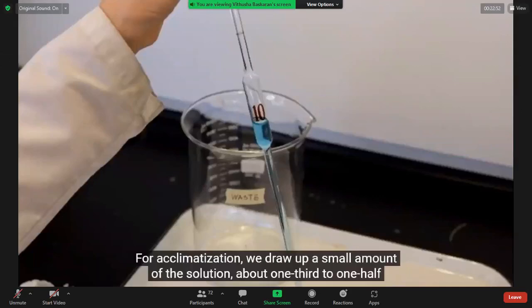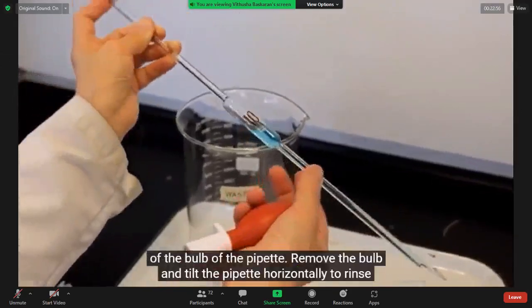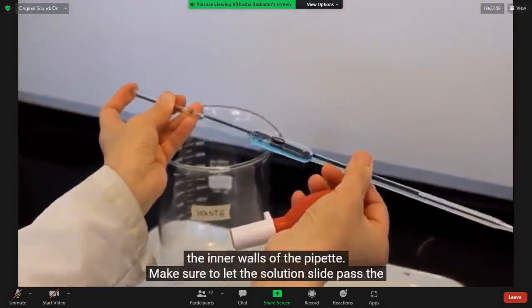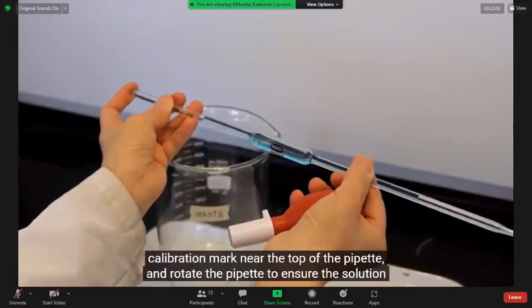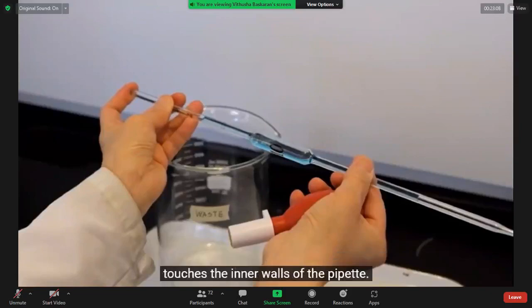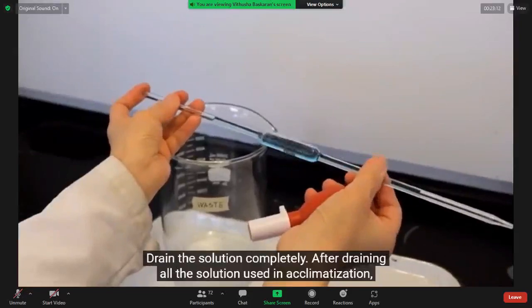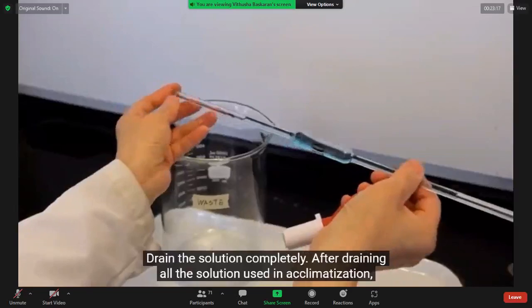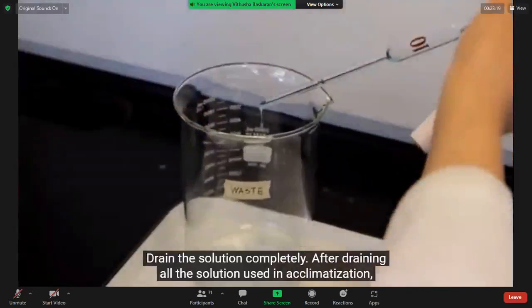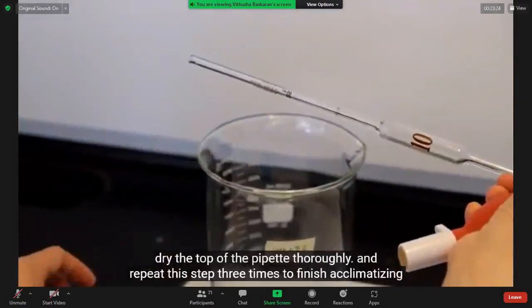For acclimatization, we draw up a small amount of the solution, about 1/3 to 1/2 of the bulb of the pipette. Remove the bulb and tilt the pipette horizontally to rinse the inner walls of the pipette. Make sure to let the solution slide past the calibration mark near the top of the pipette and rotate the pipette to ensure the solution touches the inner walls of the pipette. Drain the solution completely. After draining all the solution used in the acclimatization, dry the top of the pipette thoroughly and repeat this step 3 times to finish acclimatizing the pipette.